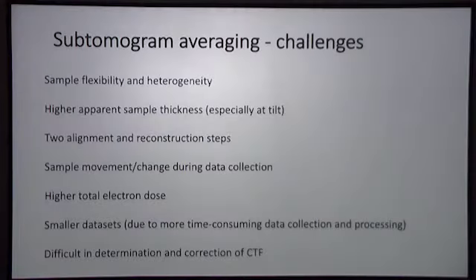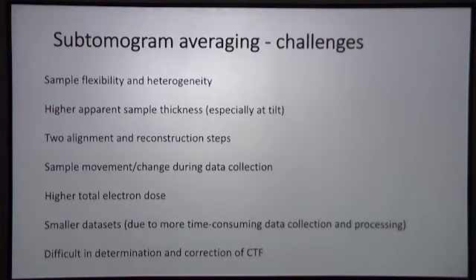So subtomogram averaging, as you're aware, remains a relatively niche technique. There are not very many labs that do it, and that's because it's still quite challenging. So why is it challenging, and what are the challenges that we may want to overcome in the future? So the first one is sample flexibility and heterogeneity.